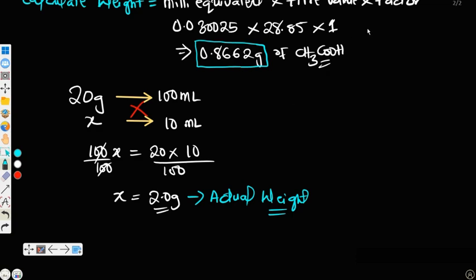So you've been able to use sodium hydroxide. All these processes we are trying to do, we've been able to use sodium hydroxide to get the exact concentration that was in the 10 ml, not 25 ml now, because the manual says pipette 25 ml, but what you guys used in the practical was 10 ml. Are you getting it now?